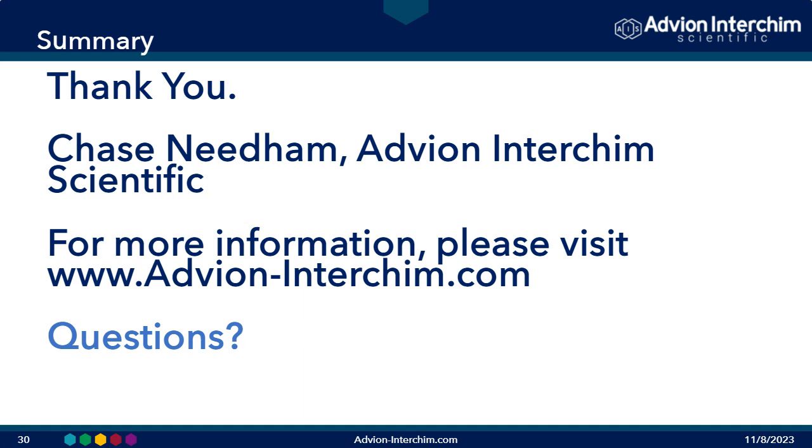So that's the number one factor, but then you're also tightly constrained by how good your separation is on the TLC plate. If you have a very poor separation, you're generally going to need a larger column, and it really will depend on how many spots you are actually interested in purifying, how far those spots are away on the TLC plate, and then again, how much sample you have in order to purify.